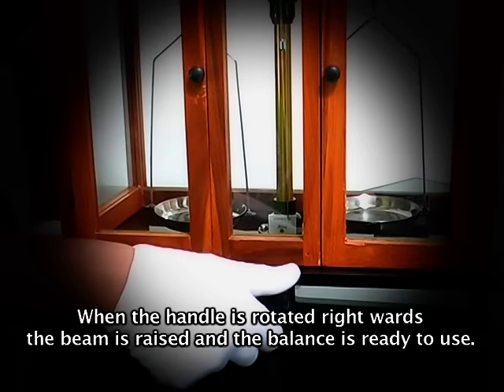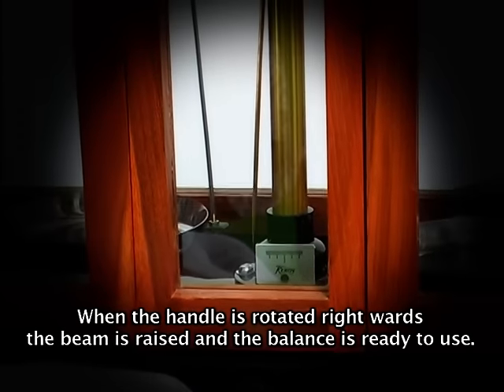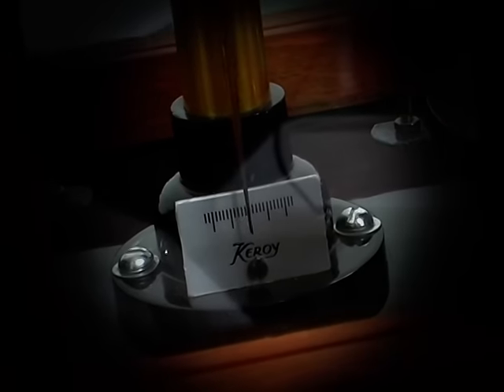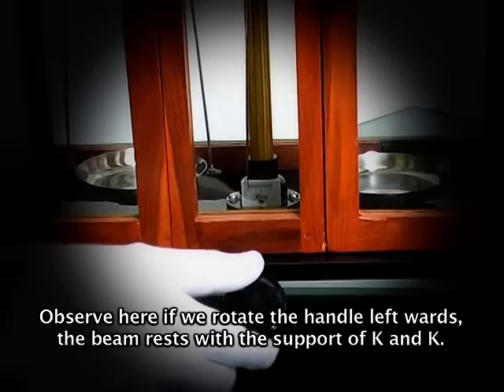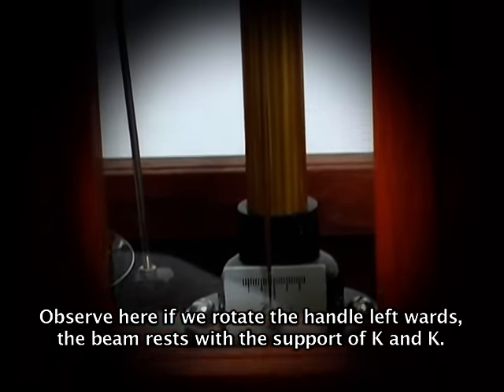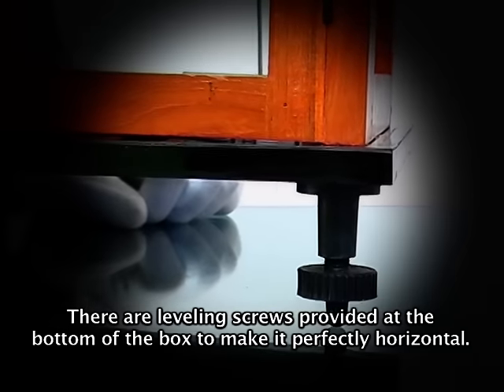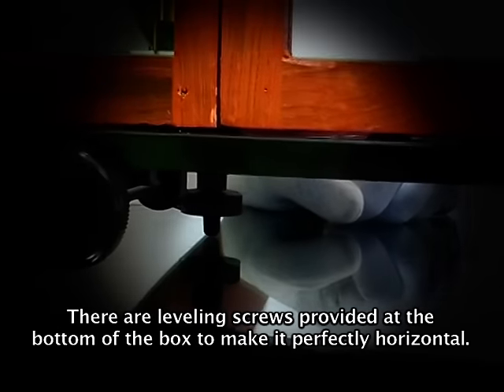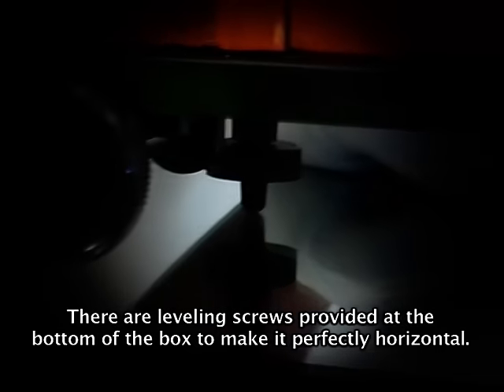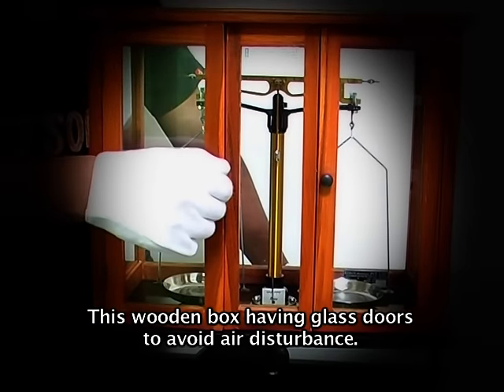When the handle is rotated rightwards, the beam is raised and the balance is ready to use. If we rotate the handle leftwards, the beam rests with the support of K and K. There are leveling screws provided at the bottom of the box to make it perfectly horizontal. It has glass doors to avoid air disturbance.